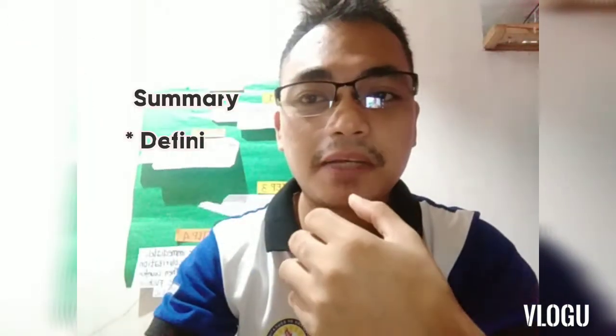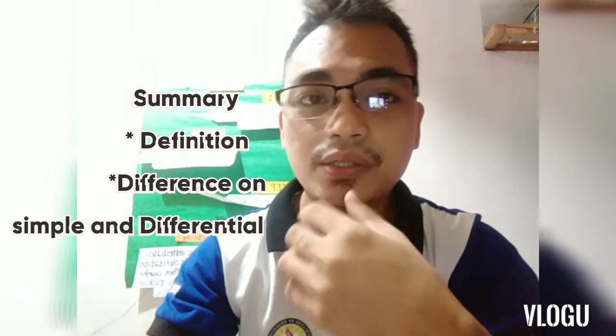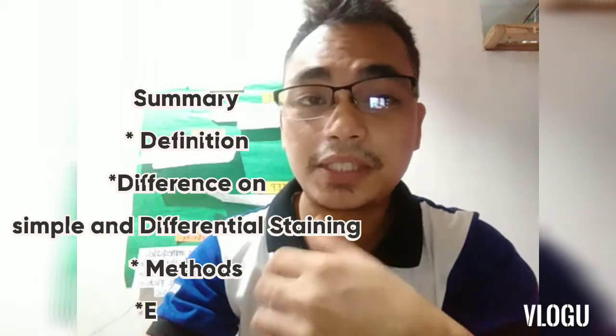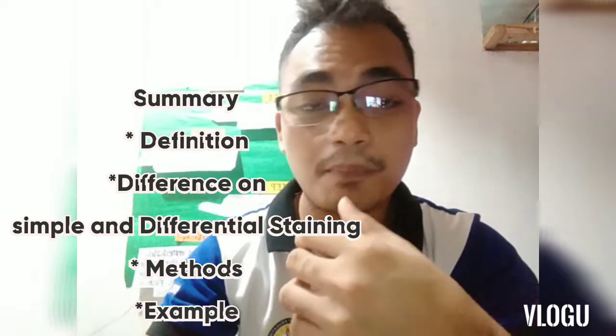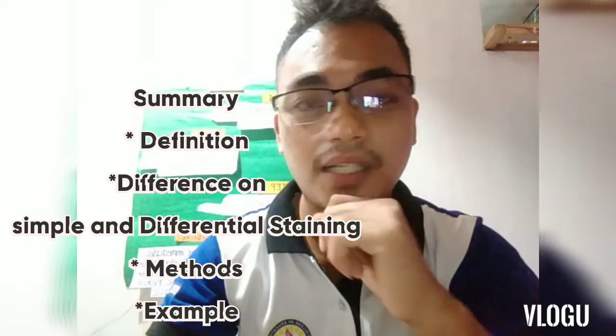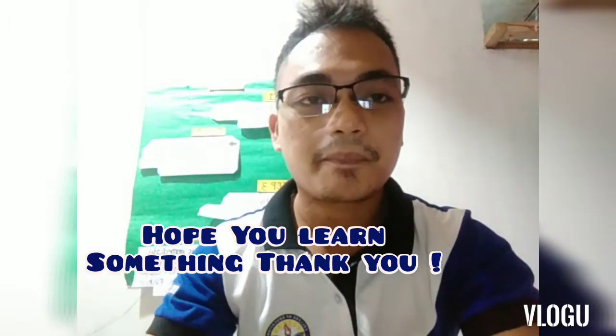Okay ma'am, to sum it up, differential staining is a process to differentiate cell structure, size, and shape. It also gives deeper information about cells, and it is composed of four steps in the method, and it has five examples, namely gram staining, acid-fast, capsule, and endospore staining. I hope that you can learn something, ma'am, from this report.